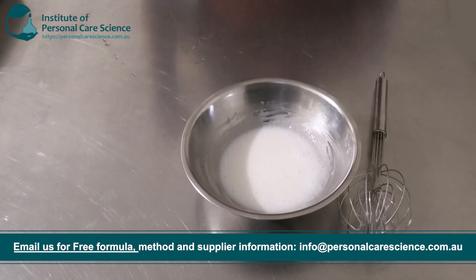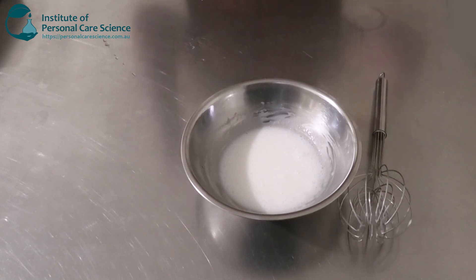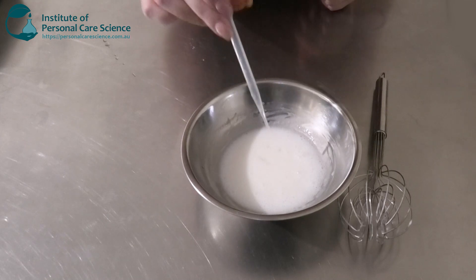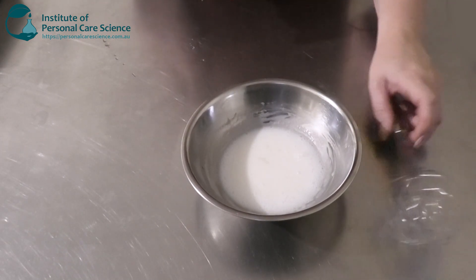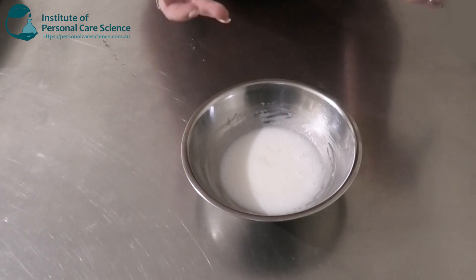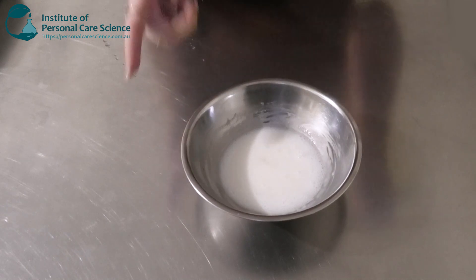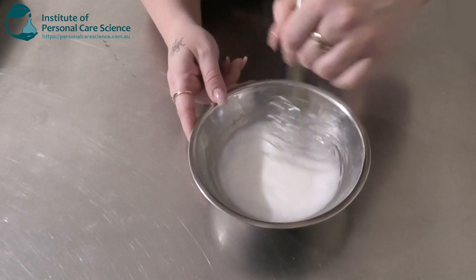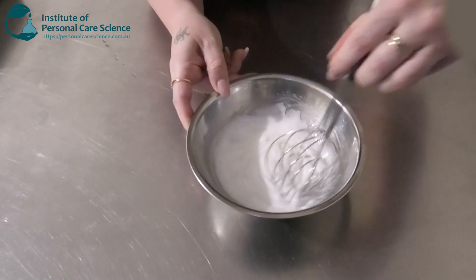Now I'm going to neutralize my Carbomer. You will see upon adding my neutralizer it is going to thicken up quite a bit and look more like a nice viscous cream. I'm going in with my tromethamine solution. You do need to be careful with the amount of neutralizer you use with a Carbomer, because too much can cause it to irreversibly thin. Also, adjusting the final pH after you've already neutralized it can also cause it to irreversibly thin, which is not what we want. You can see it's starting to thicken up quite a bit, which is what we want.